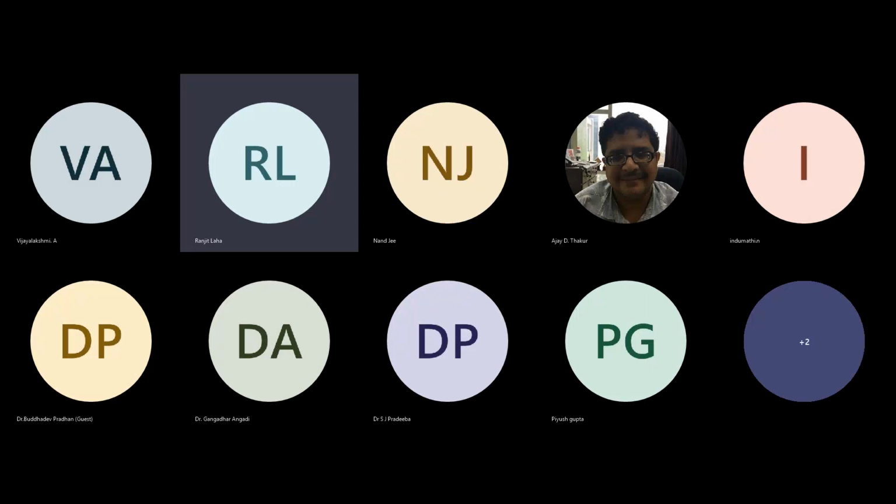The atomic force microscope is just one mode of the whole facility, whereas the other modes, as he has already told, are STM, EFM, and MFM, magnetic force microscopy. There are many different imaging techniques. More or less all of them are done on the sample surface to find different kinds of properties.